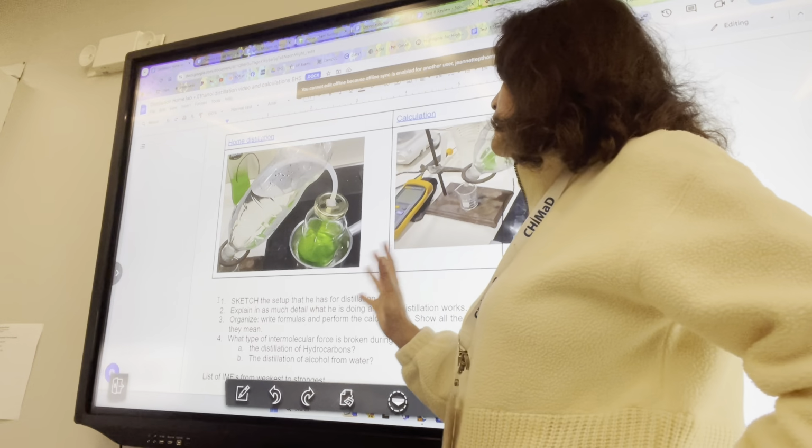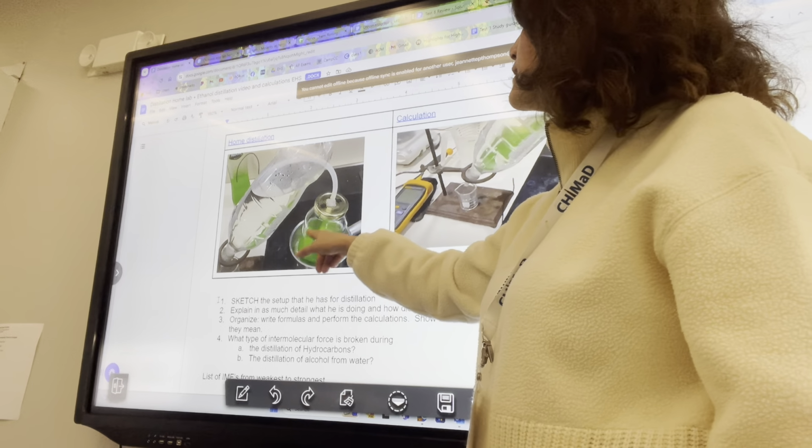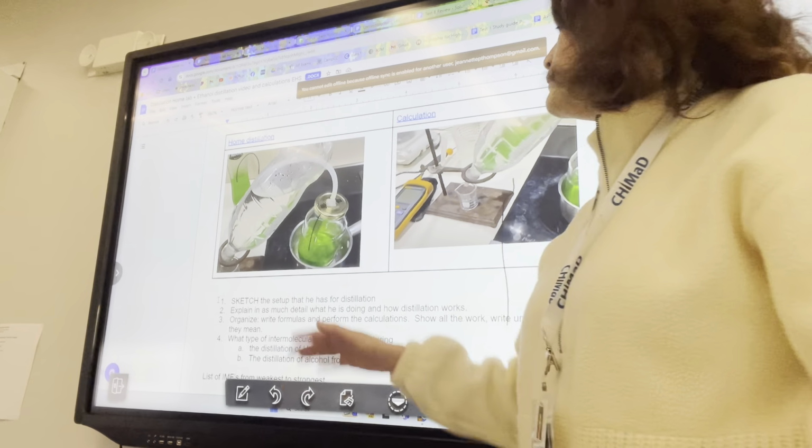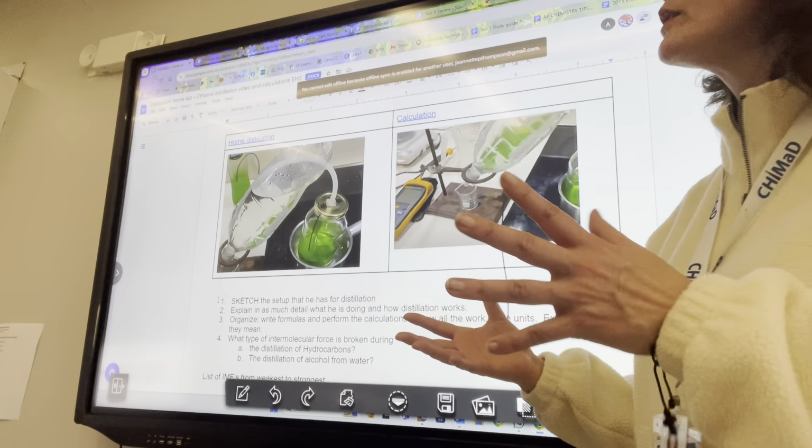And he didn't boil it forever. It could have been dangerous. This jar is not for heat. It could have broken, right? We should have had other things in order, but it worked fine.